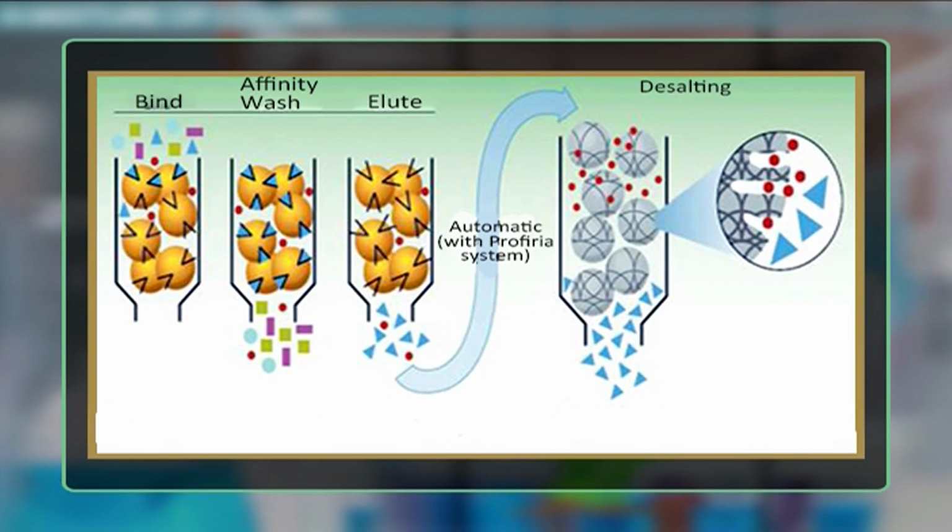Affinity chromatography separates proteins on the basis of a reversible interaction between a protein or group of proteins and a specific ligand coupled to a chromatography matrix. The technique is ideal for a capture or intermediate step in a purification protocol and can be used whenever a suitable ligand is available for the proteins of interest.